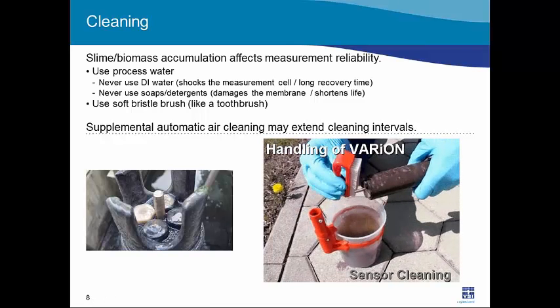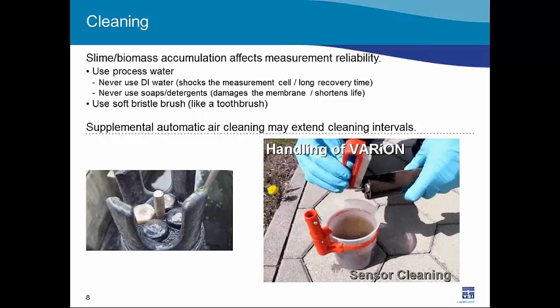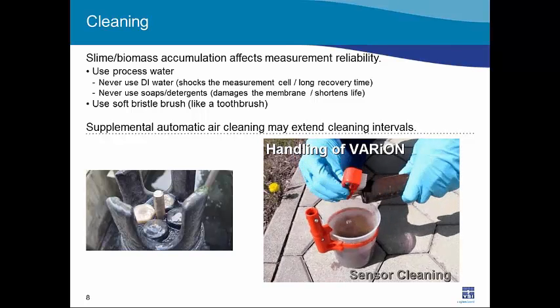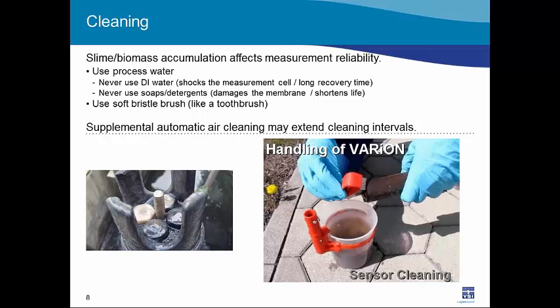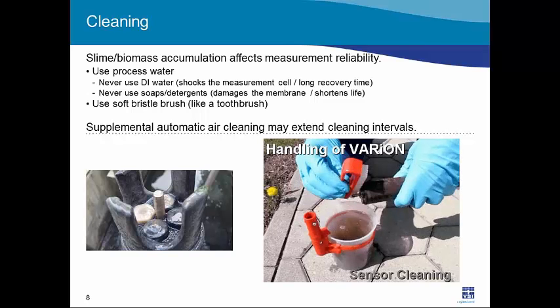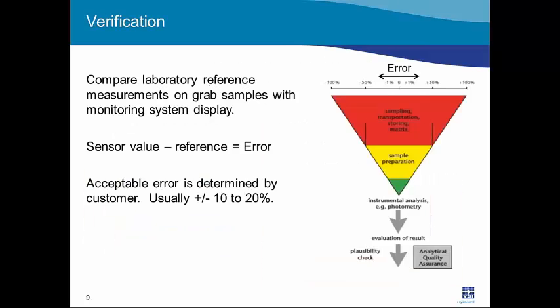From a cleaning perspective, a soft bristle brush is recommended, like a toothbrush, for example. And I have a little video here demonstrating proper cleaning technique. Again, the person here has a beaker from a sample dipper, and you can see it's got a lot of solids in it, but that doesn't really matter, because all you're really trying to do is remove that slime layer, the bulk contamination, before you put it back into the sample.